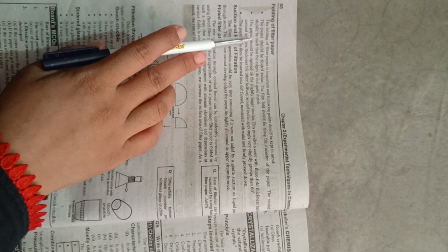halfway around and one thickness the other halfway around, and an apex angle very slightly greater than 60 degrees. The paper may then be inserted into a 60 degree funnel, moistened with water and firmly pressed down.